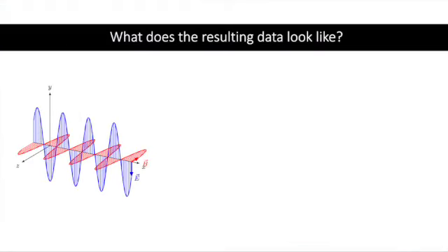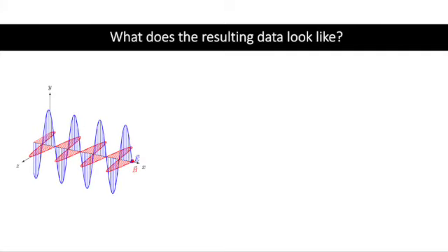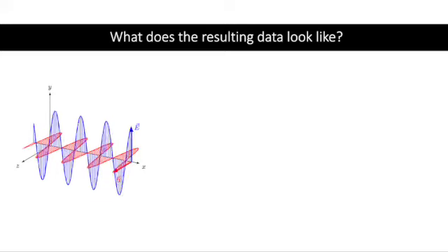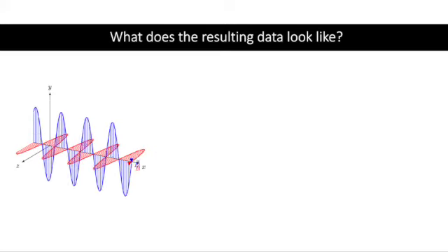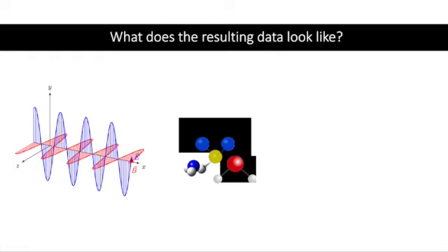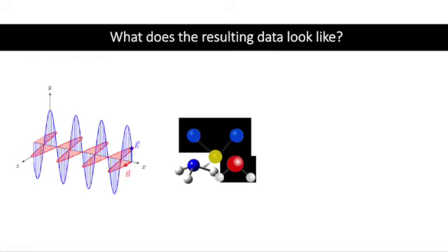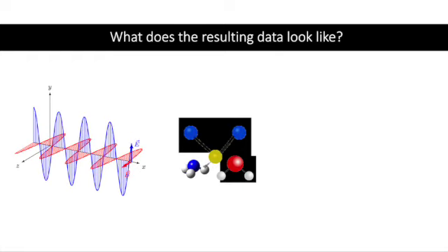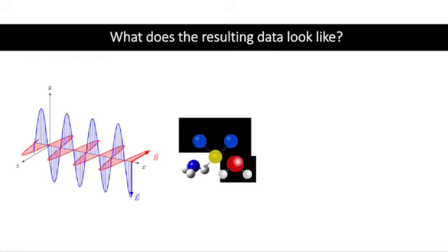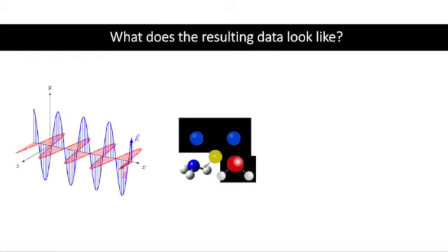For each IR experiment, an infrared electromagnetic wave is first generated and beamed towards the sample. Typically, a sample would be composed of different types of molecules, and each molecule has its own unique resonant frequency or vibration.